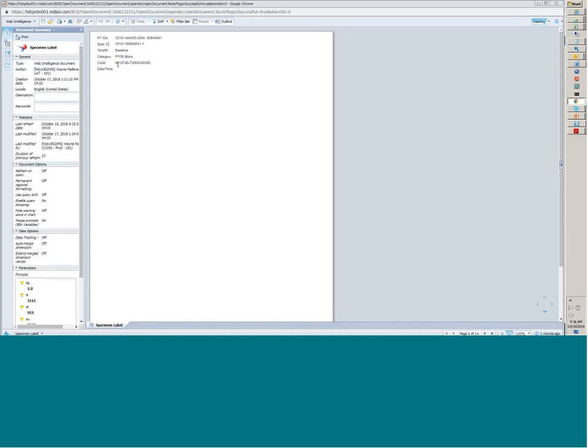M stands for metastatic. That was the tissue type. We have the block ID and the surgical pathology ID. So these 3 are joined together in one line of codes. If it was a blood sample, it wouldn't have that code list here. And the date and time are empty.